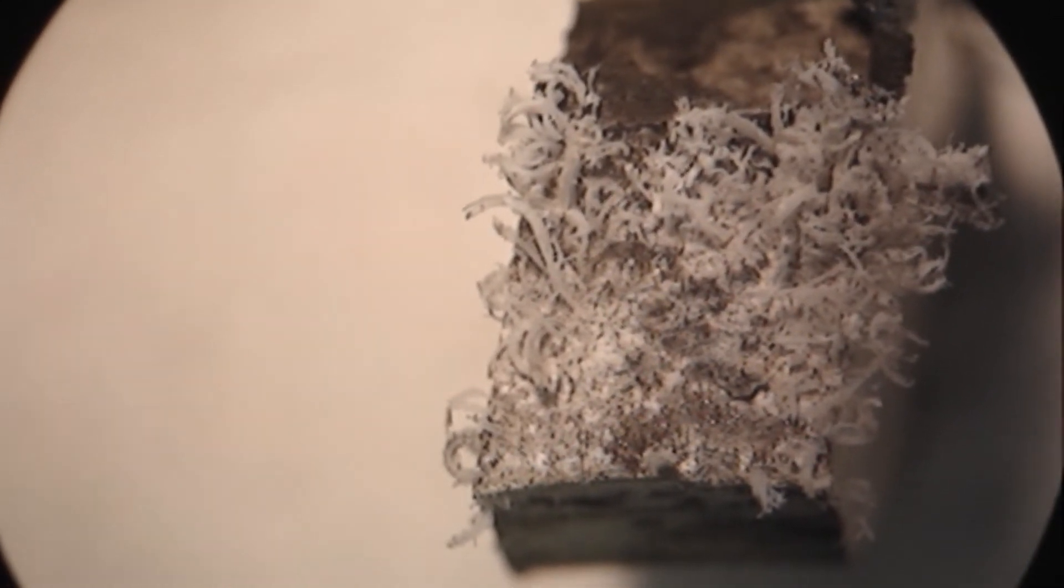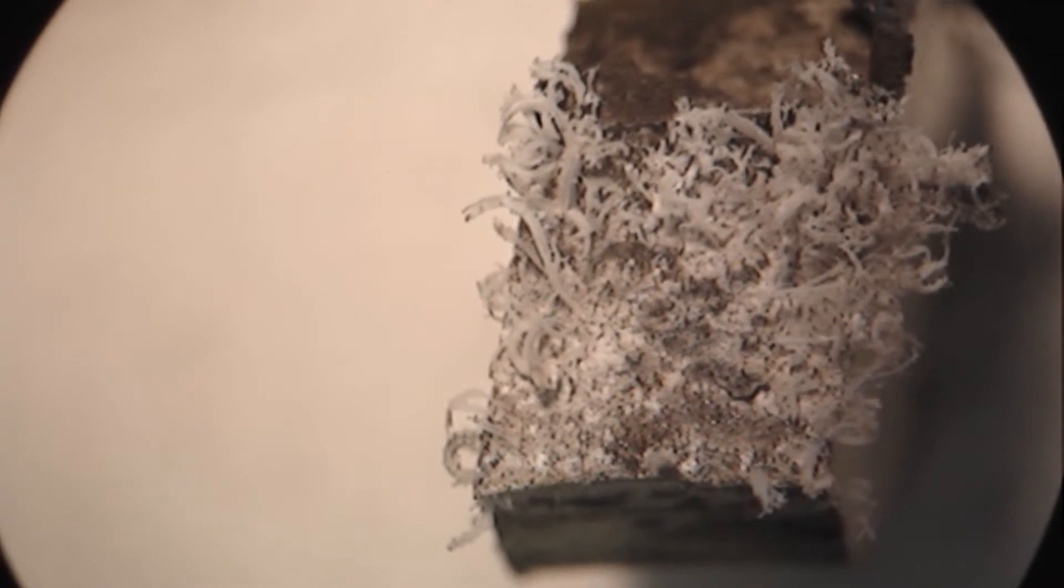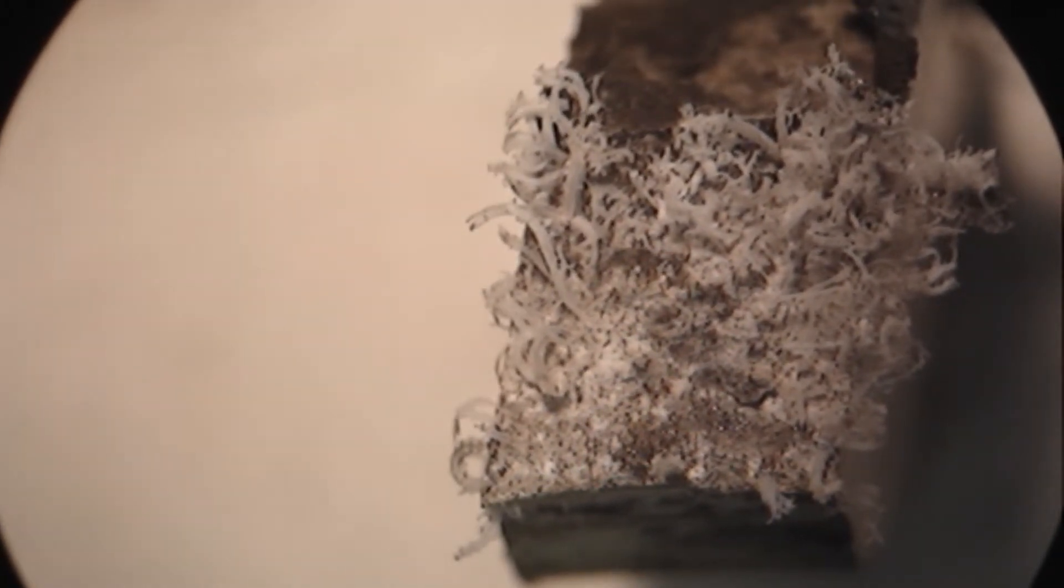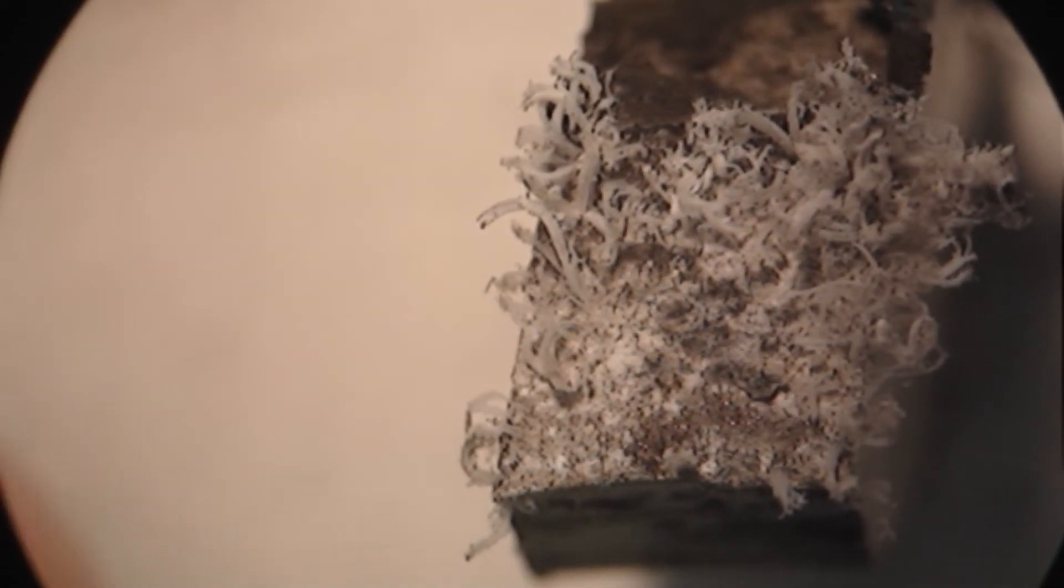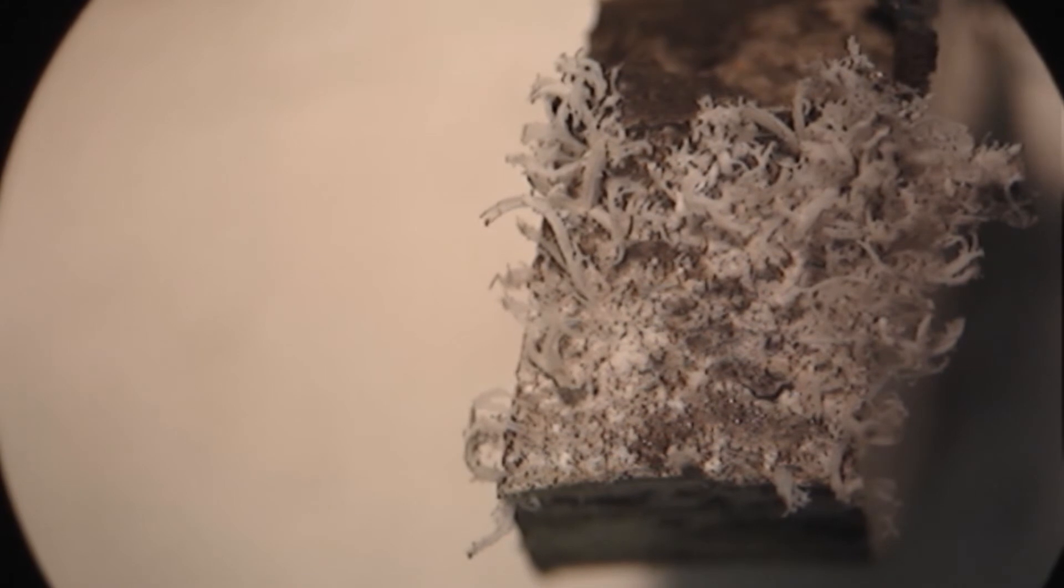Unusually the filiform corrosion is producing filaments coming off the surface. This is probably because there are tiny droplets of mercury causing the corrosion to take place and the corrosion product is forming right around the droplets as a ring.